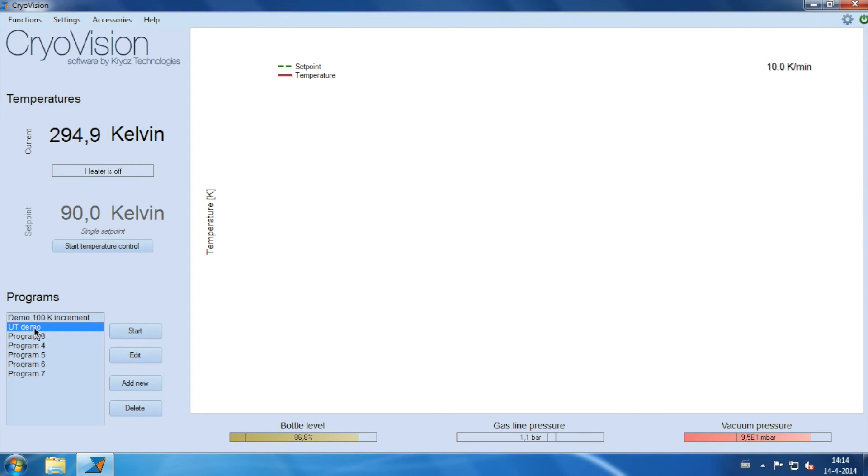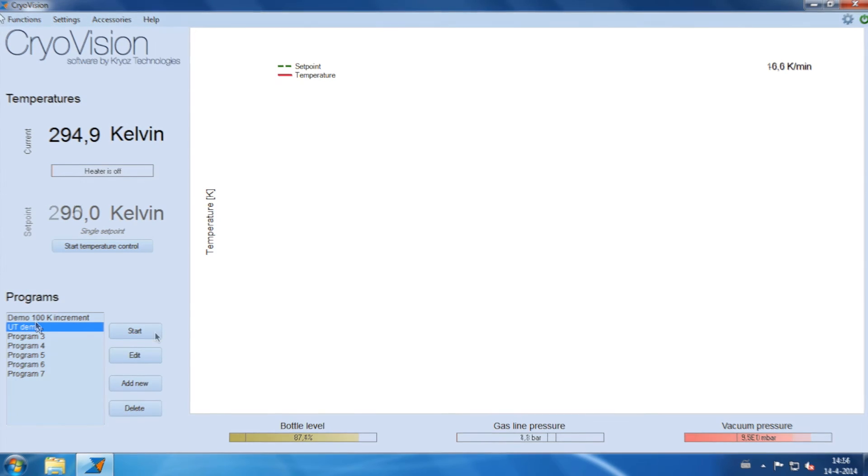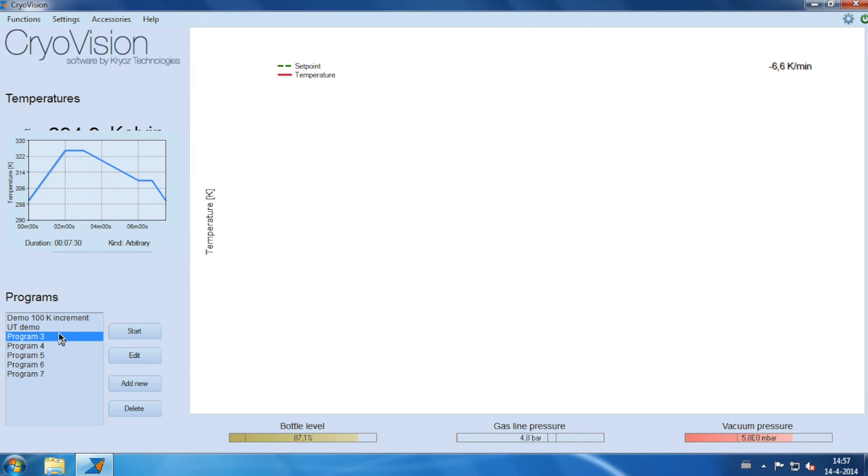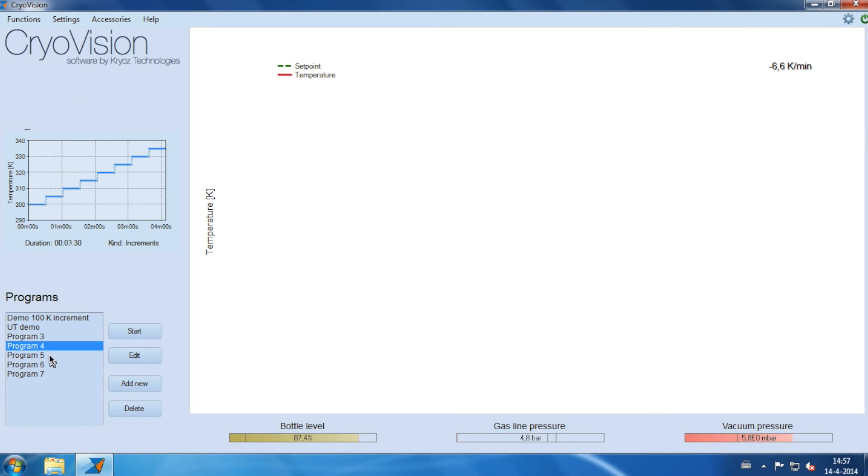In this area, you can find any available programs which are saved on the actual hardware. From this menu, programs can be started, edited and deleted or a new program can be created. When the programs are clicked, a small preview is shown above.